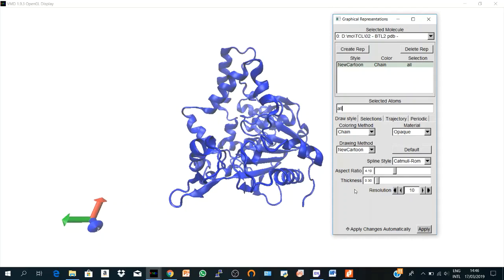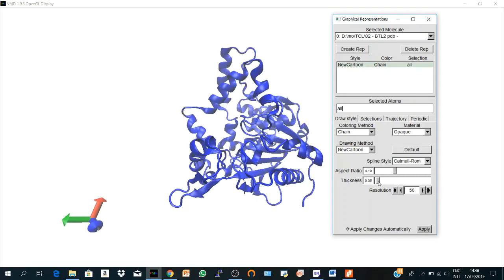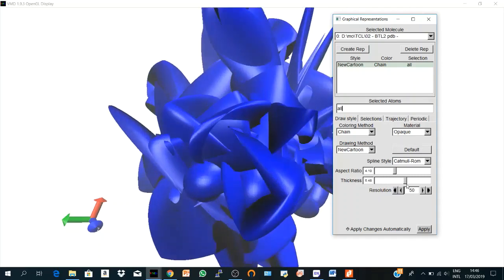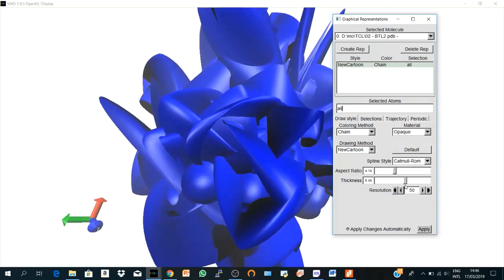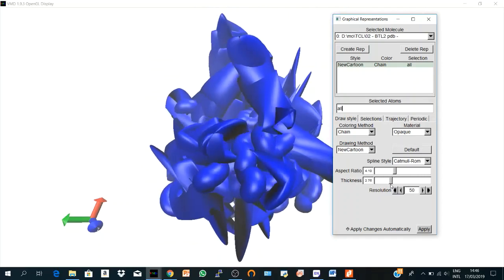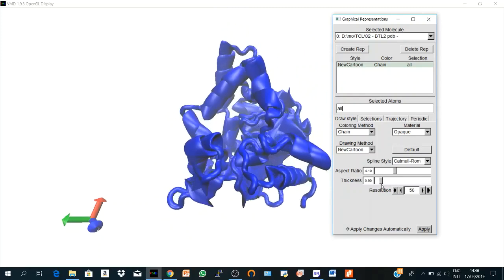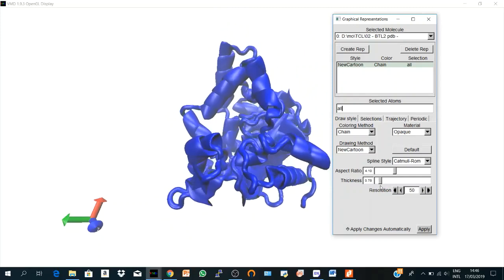And here we have the resolution of our structure. You can increase the resolution to get nice figures. The maximum is 50. And here is the thickness of your structure. If you see this, it's so crazy. So you have to adjust it to get some rational figures.